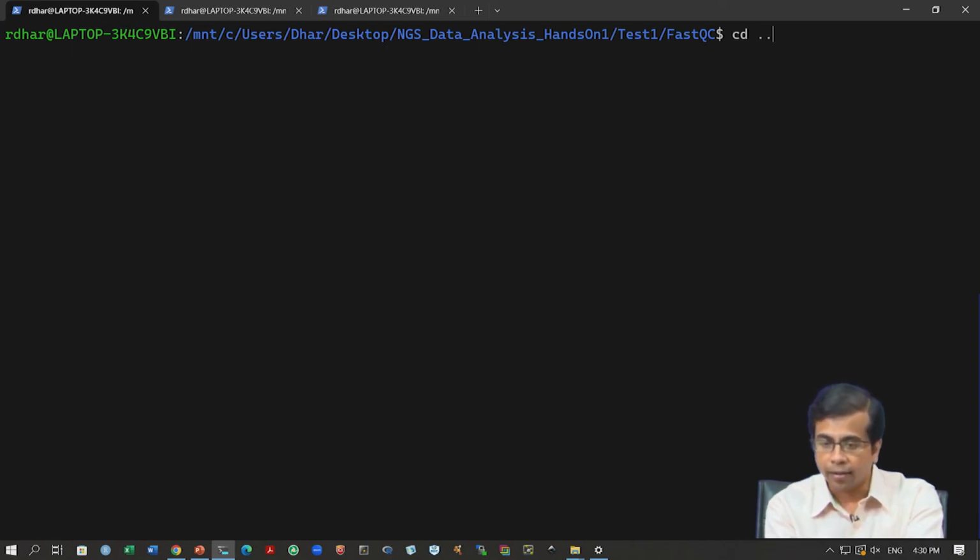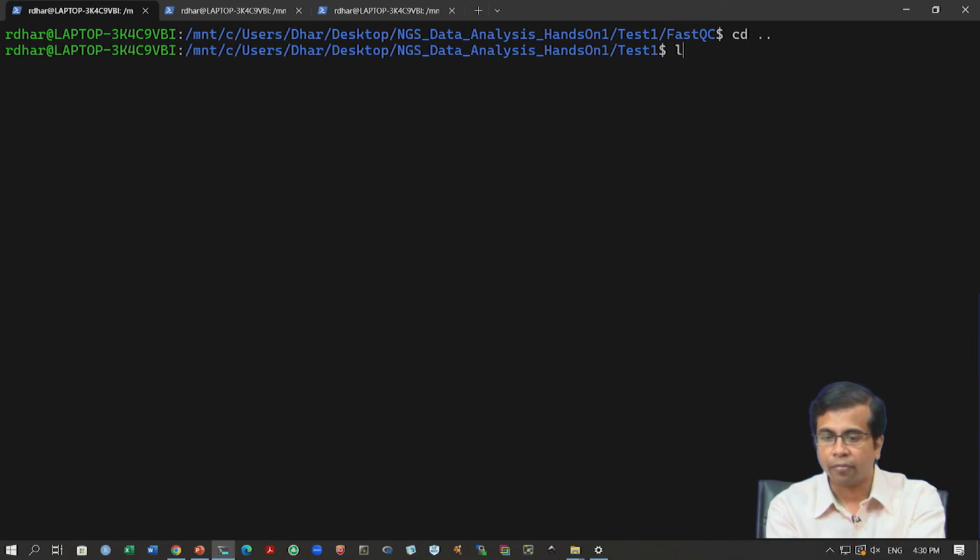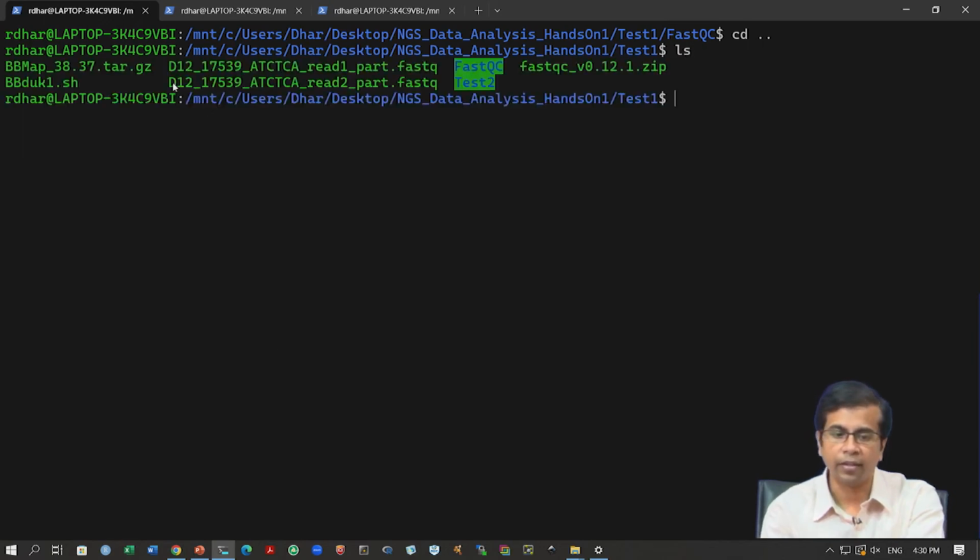So, to run that I will just come out because our data files are here in this folder, right. So, we need to give these data files to that program. Okay. So, I will now call this program, right, because this is inside this folder. So, I will have to go inside that folder to call this program. Okay. And you notice I have given this dot slash, which means we are executing this program, right, we are calling this program in there. Okay. So, this is how we will call this program, right.